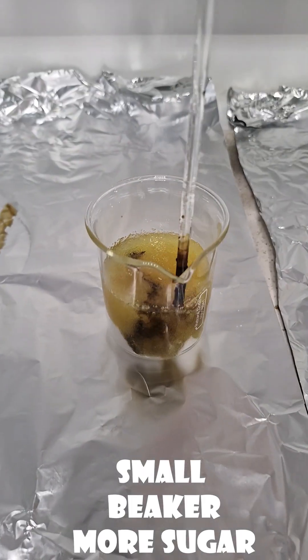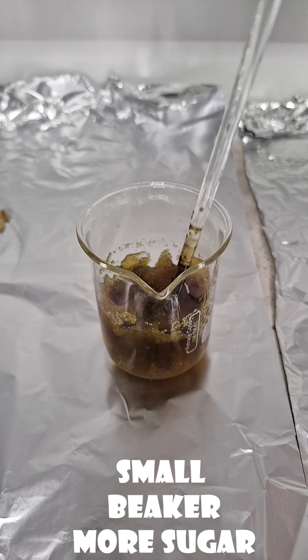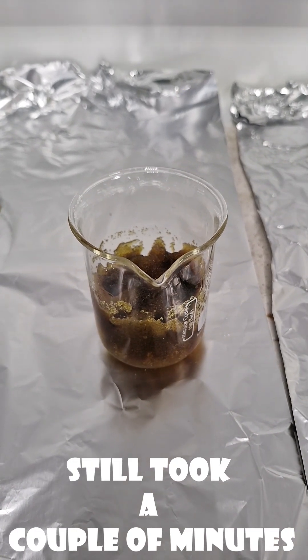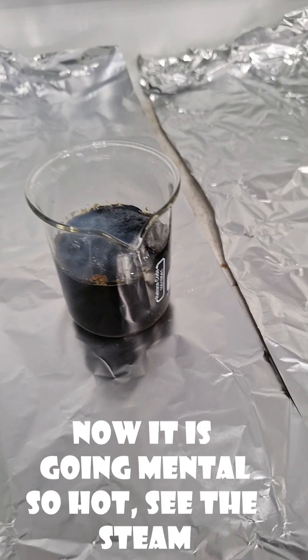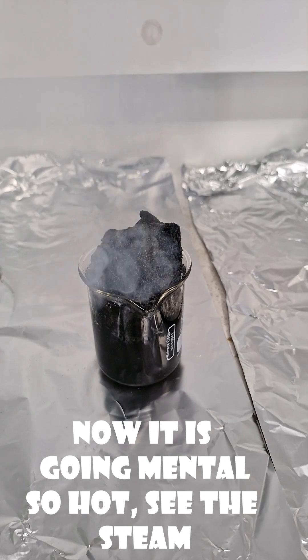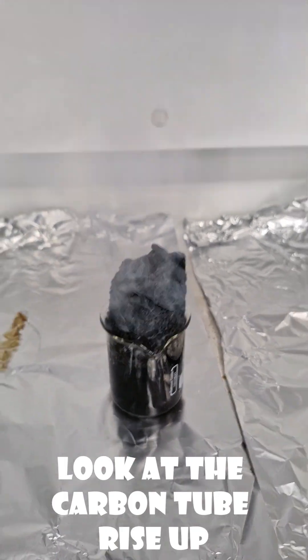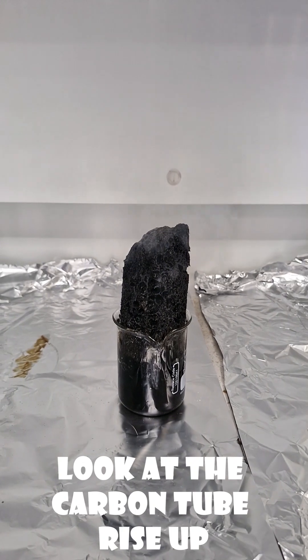Now we did it in a smaller beaker with more sugar. You can see here, once I've mixed it all together — it took a couple of minutes, but we sped all these videos up to make it look a bit quicker. Look at all that steam coming out there and all the carbon rising out like this big tube of carbon. And you can crush that when it's all dried up because it's just really dry, brittle carbon.